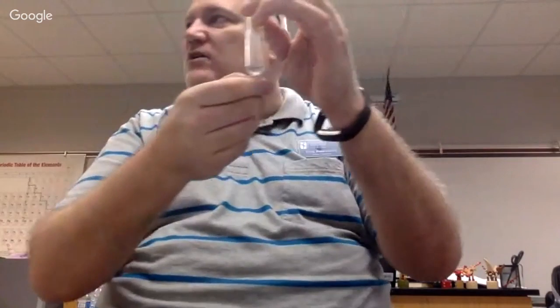And our goal is this: you're going to have some particles inside your test tube. Everyone look at me here. So after you've done heating, you pull it out. You're going to see some sort of color, and you're going to see particles. When you start putting the hydrochloric acid in, it will start dissolving the particles that are inside there. But if there are still particles sitting on the bottom, you can keep on adding hydrochloric acid, and those particles aren't going to dissolve because the hydrochloric acid isn't reaching them.